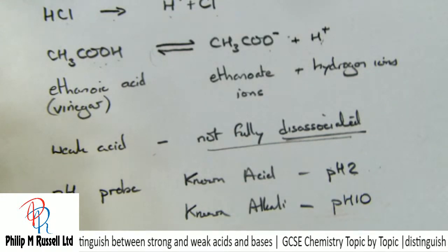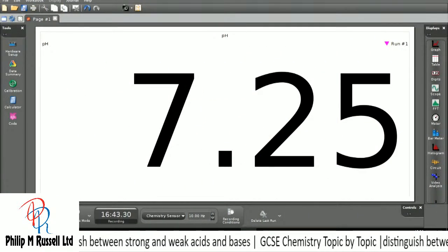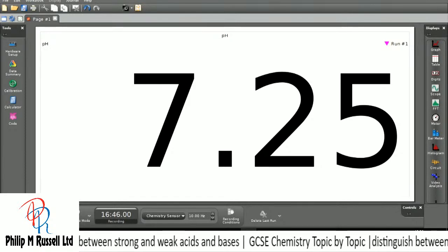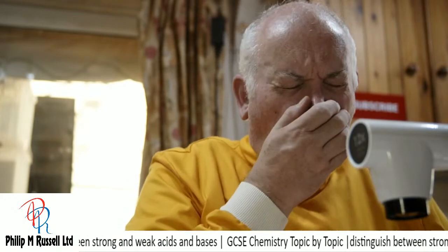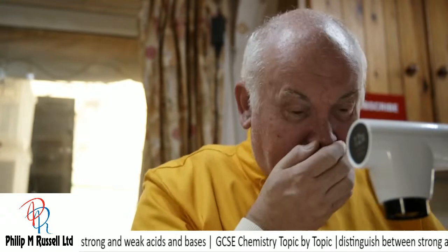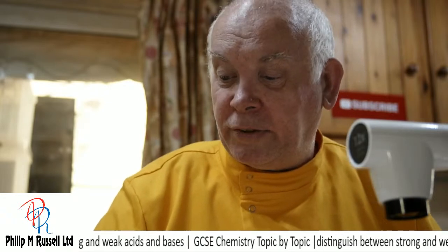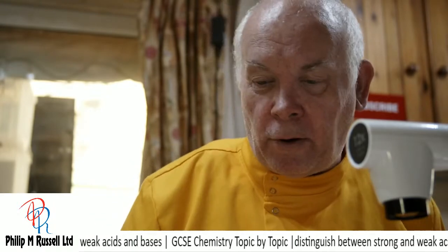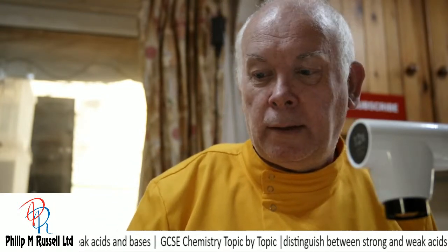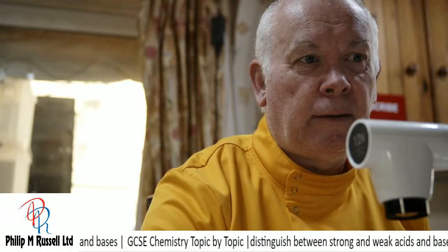Having left my pH probe, you'll see now it's gone happily back to pH 7.2. So it's about right for the water. One more. Don't know why I always sneeze in threes. So we've had a look at some strong and some weak acids. So we've now got an idea about the difference between those.